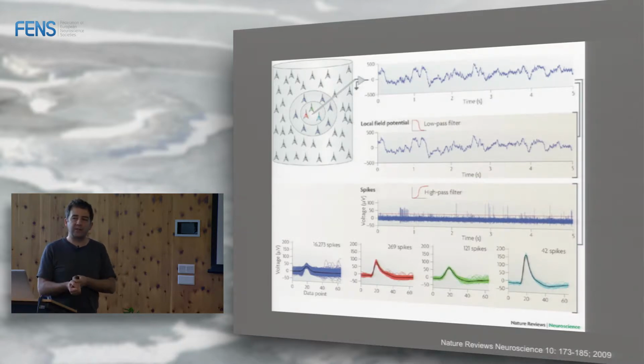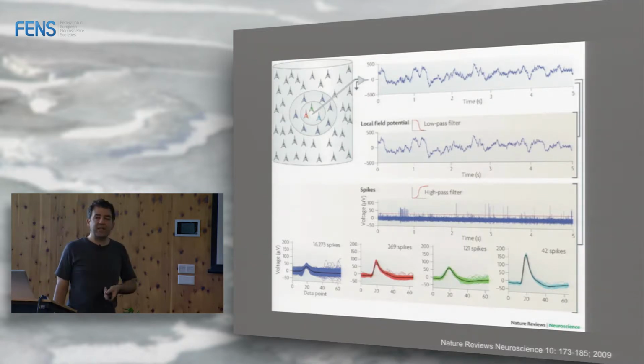We cannot separate it. And the neurons that are further away, we don't even detect anymore because they are too far. So these are the neurons that may have spikes that are below my detection threshold, which is this red line. For example, these tiny things here or the noise. So the neurons that are further away, they contribute to the background noise that I see in my recording, right? So that's the job we want to do. We want to split the different shapes.